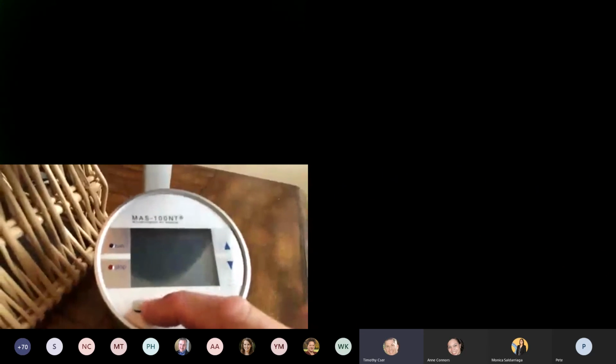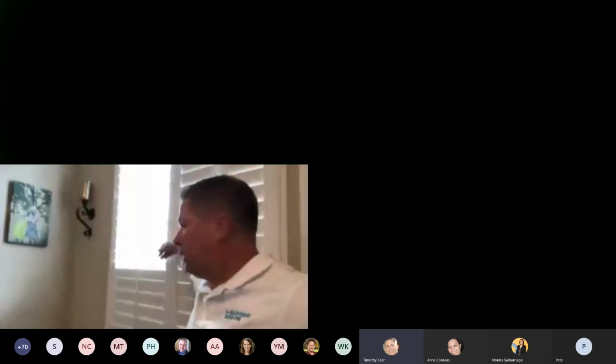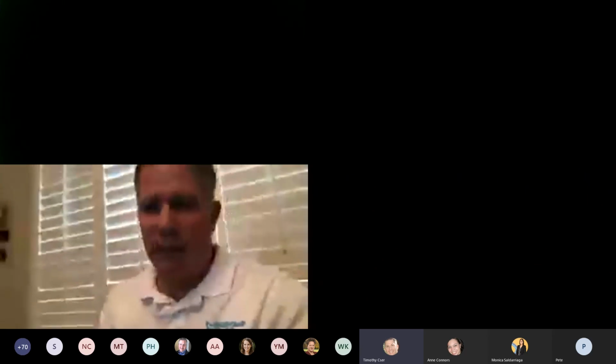And my calibration, let me start this up again. 12 months, this next calibration is due. Okay, so I'm going to close these here. That was the calibration aspect of the MAS100 with the Da100 NT. So that was, as I said, 5 to 10 minutes. We've been on this call for 20 minutes and it was probably about half that. So it really is about 5 to 10 minutes.